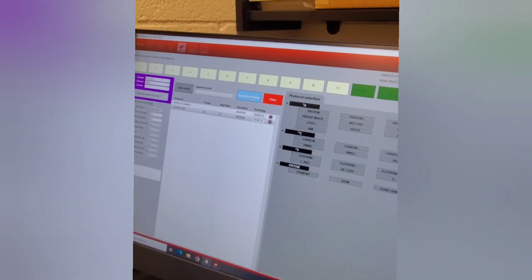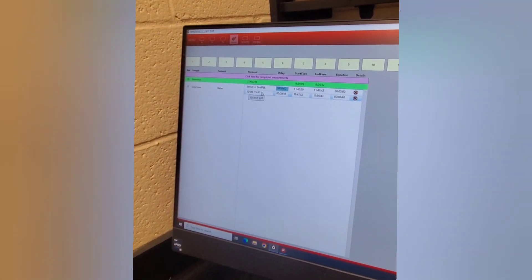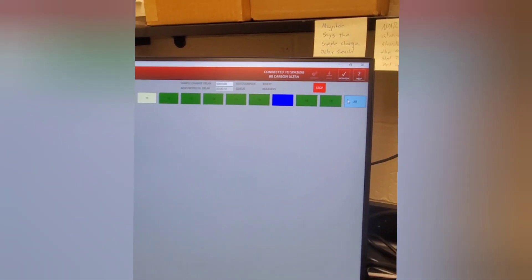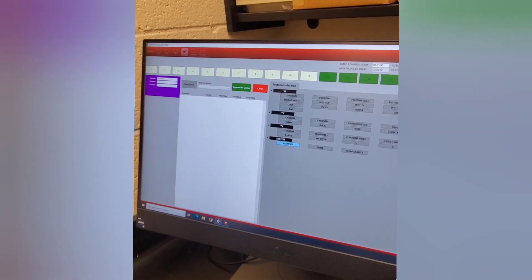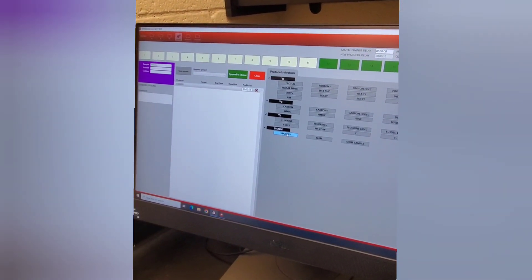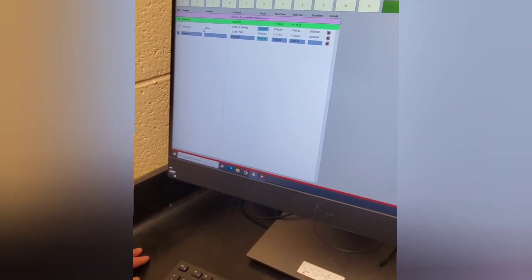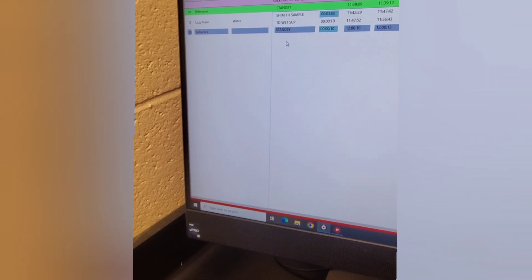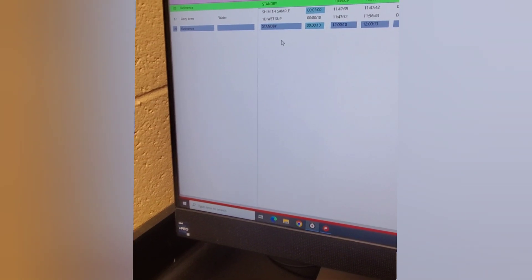Once all that's done, I'm going to append to the queue — that places my sample into the queue. After this sample, I want to put the reference back in, so I'll go back to slot 20, click on that, send the system to standby, and append to the queue. Now you'll see: reference, then Lizzie Brew, and finally the reference again at the end. That's always the way we want this to look.